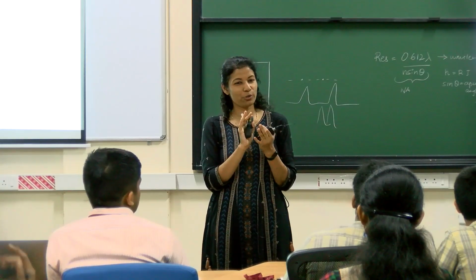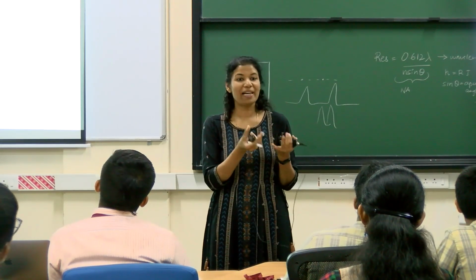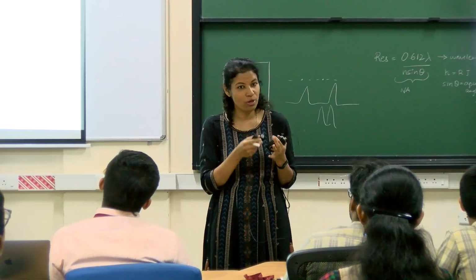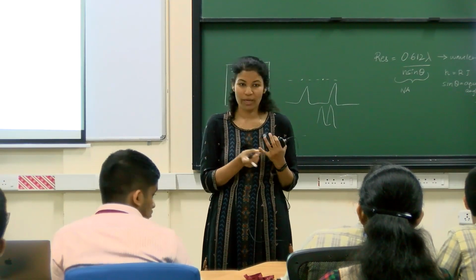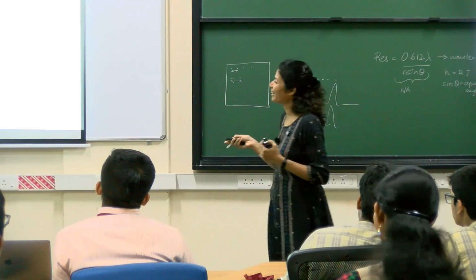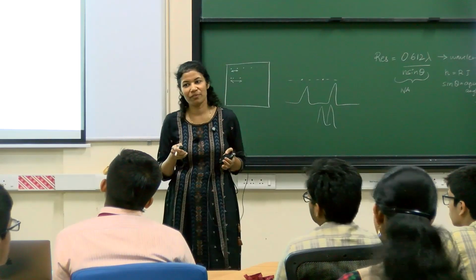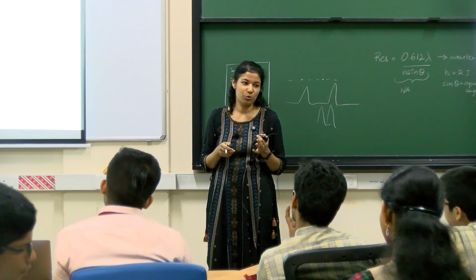In an electron microscope, the features are a little different. They are not exactly the same. We don't have glass lenses, but I'll show you what we do instead of that, okay? I'll come to that. If I forget, just remind me again, okay? So you get a very high magnification, about 23,000:1.